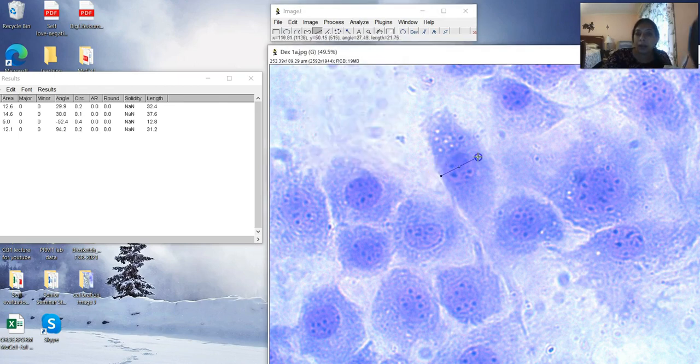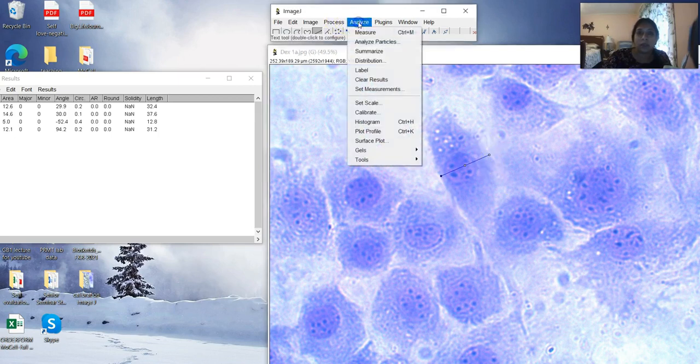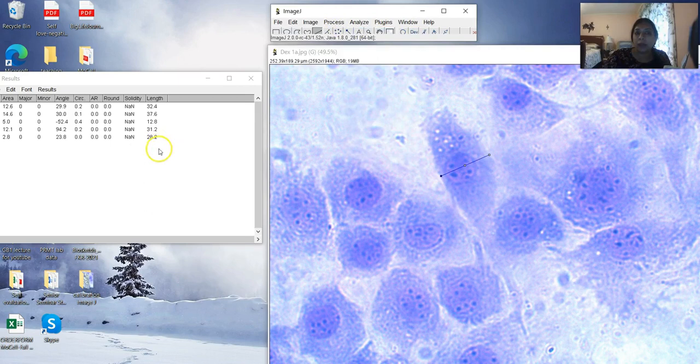And I will click OK. And let's go ahead and check this one out. So let's start with this particular cell that's right there. I take the edge of the cytoplasm from one side to the other, and I measure. And lo and behold, you get a very similar number to before. Let's do another cell right here just to see the comparisons. This one, and measure that.